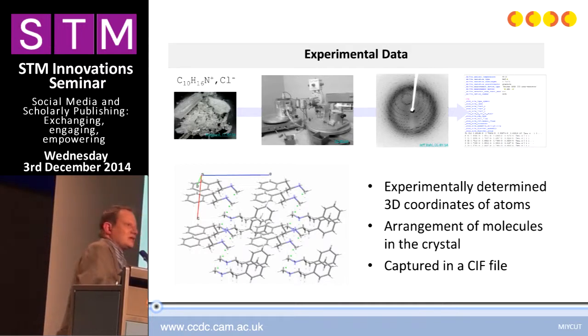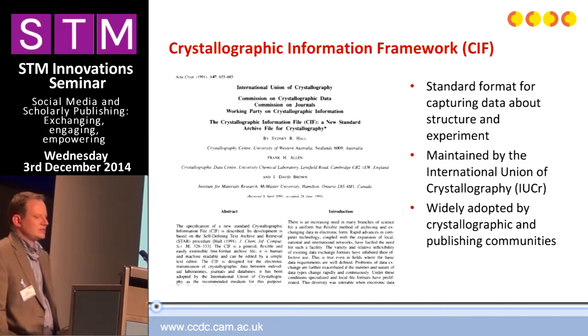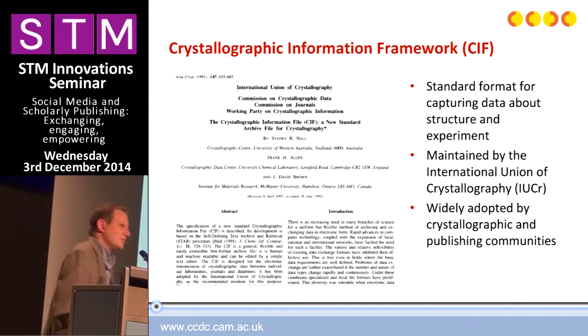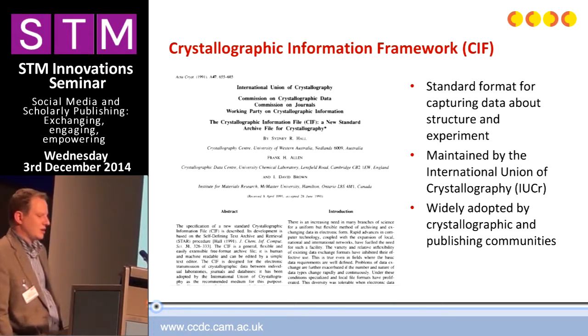CIF is a standard format that was introduced in the 1990s and developed with input from the CCDC, and it transformed the way in which crystal structure data is communicated, not least because of its wide adoption by both the publishing and the crystallographic communities.